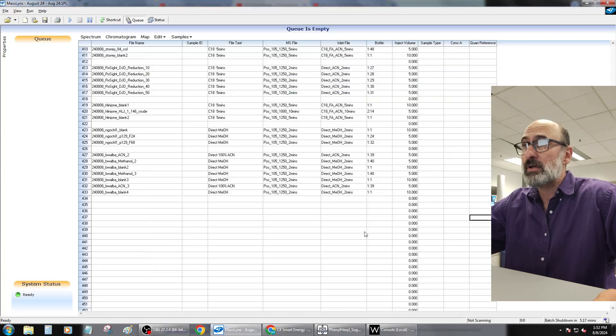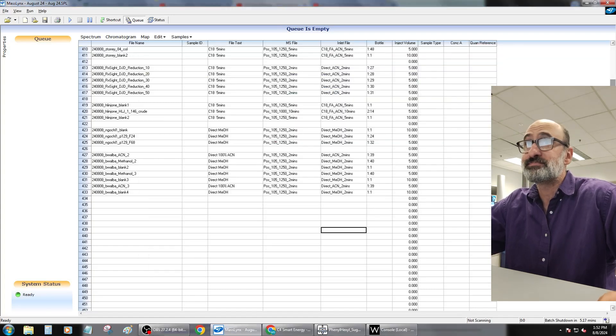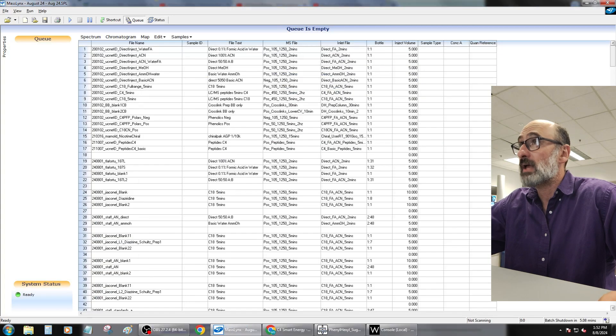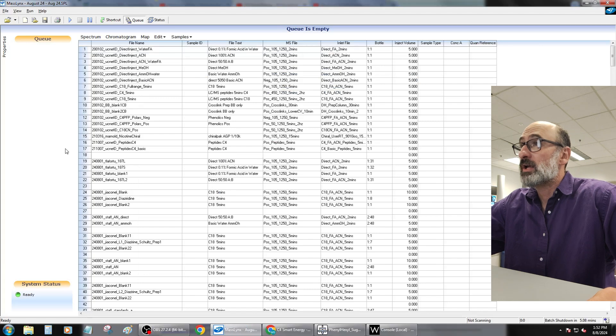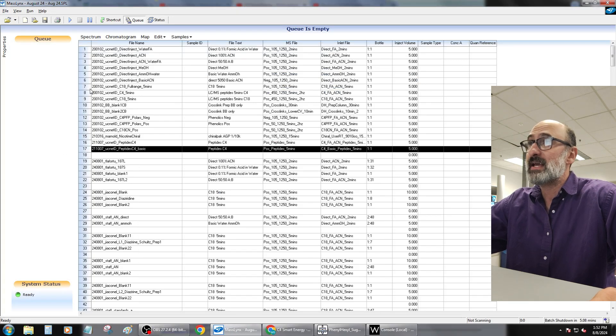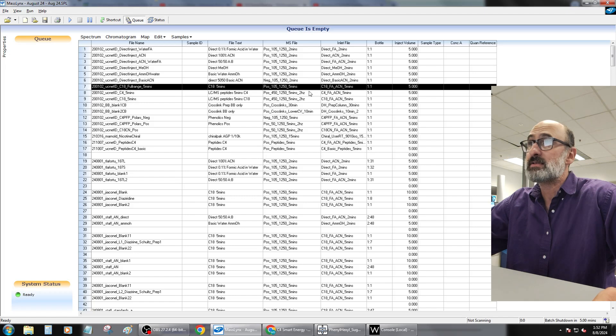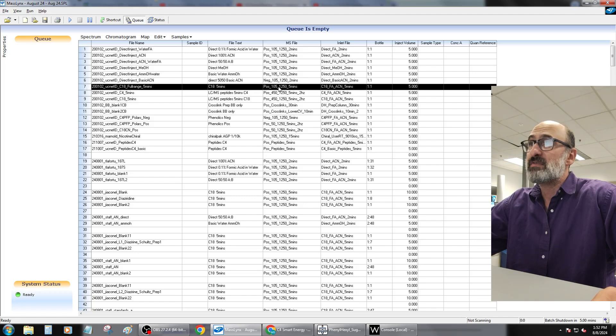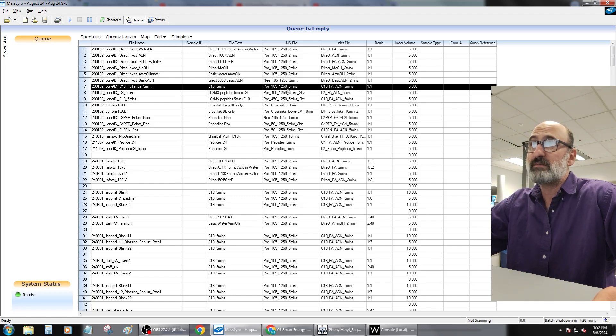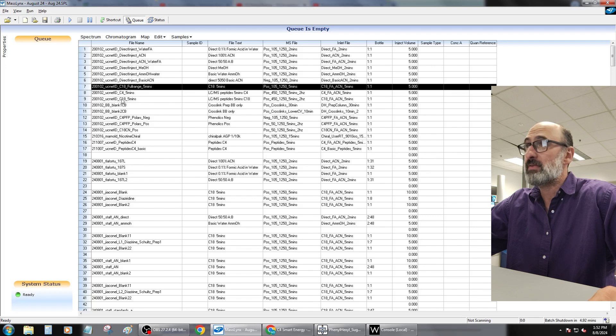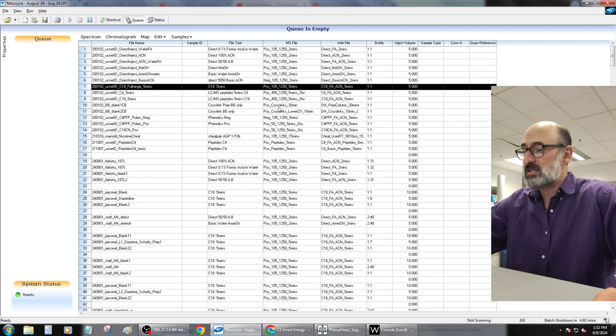Alright, so now we're going to go ahead and run those samples. We're going to go up to the top of the list here and take our regular C18 method. This is just our positive mode 105 to 1250 positive mode C18 method. It's the full range C18 that we showed before.